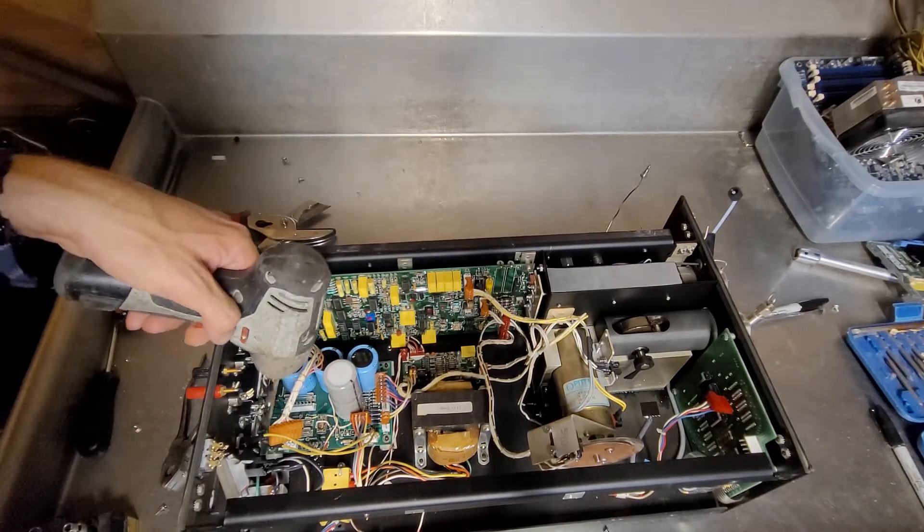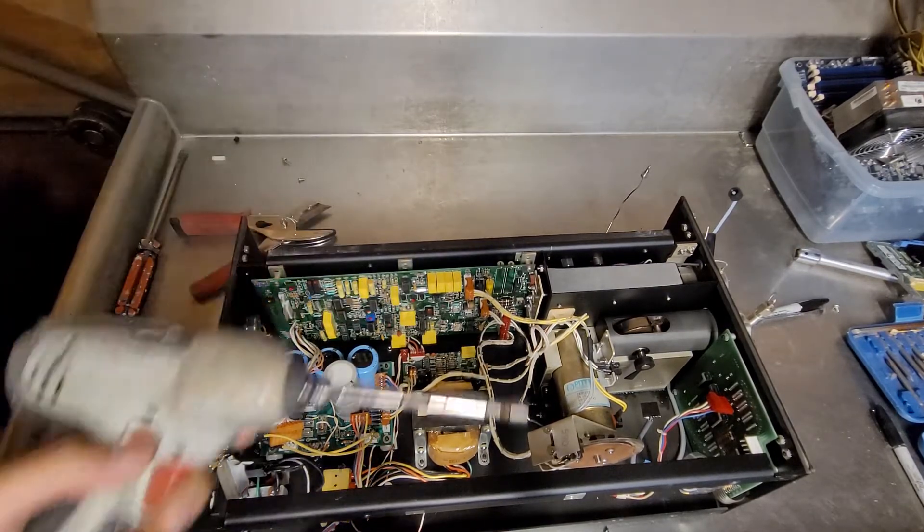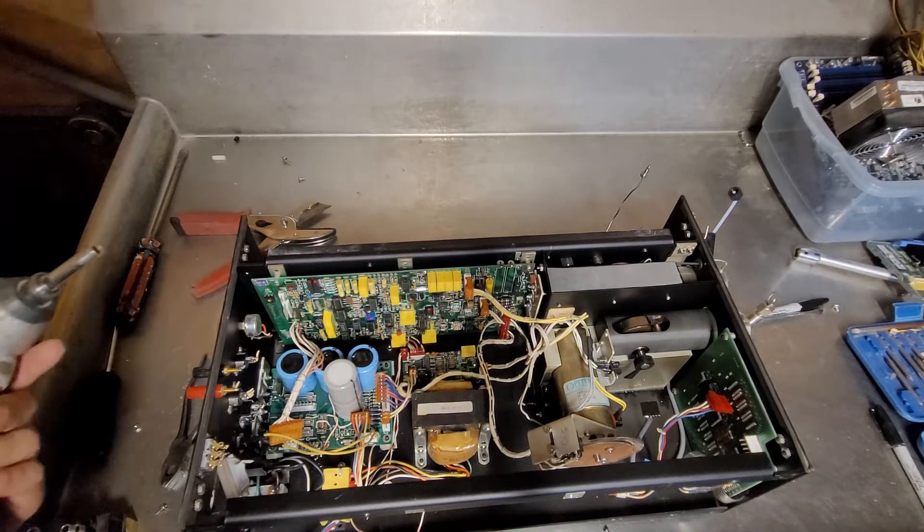They used the housing to heat sink the transistors for this one.